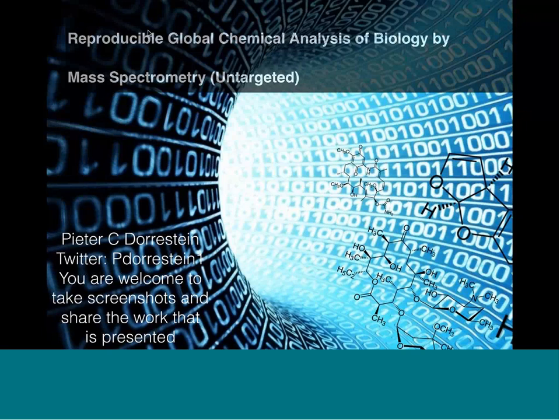How do you export? When you do an analysis run, there's a feature table at the bottom of the link in your analysis run, and you basically create a BIOM format file, and that in turn is what is imported into Qiita. So we have workshops on this periodically, and we're happy to provide. People can email me, and we can tell them when these workshops are.